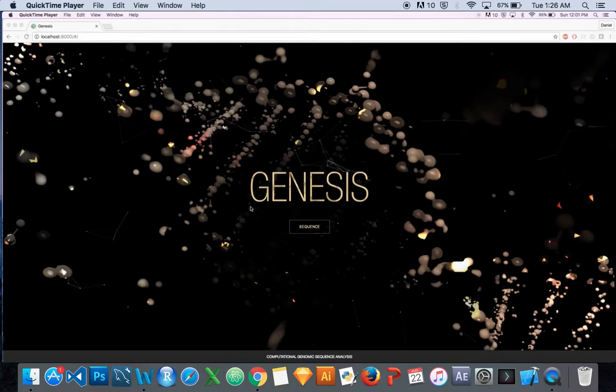So, all in all, this program is mostly for genetic researchers, mostly at the University of Washington academia, that helps analyze genomic strands from the GenBank database and cross-analyze different species to create phylogenetic trees and look at where certain mutations happen, where each strand deviates from the parent strand. It just simplifies it, makes it a more intuitive GUI, gives you visualizations for better understanding.